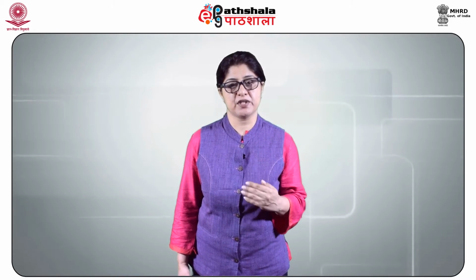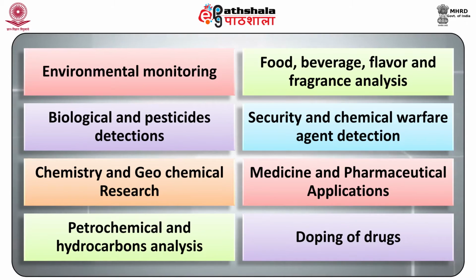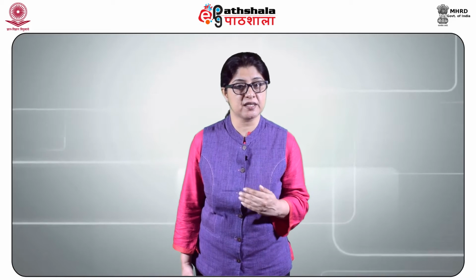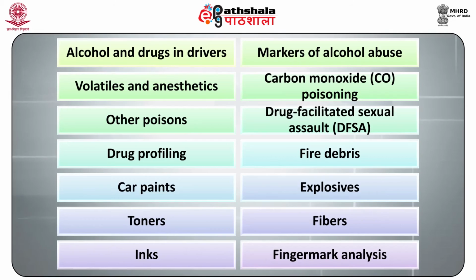It has established applications in various fields such as environmental monitoring, food, beverage, flavor and fragrance analysis, biological and pesticide detections, security and chemical warfare agent detection, chemistry and geochemical research, medicine and pharmaceutical applications, petrochemicals and hydrocarbon analysis, doping of drugs.